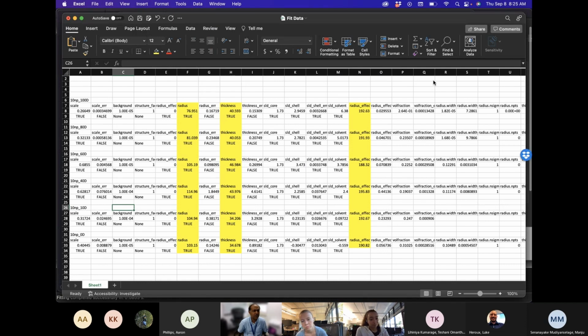Is it possible that you prepared them separately and they have different sizes? No, these should be the same. To achieve the different deuterations, we just mixed solutions of all deuterated water nanoparticles and undeuterated water nanoparticles. So they have all the same components. Interesting, I would not have expected that.